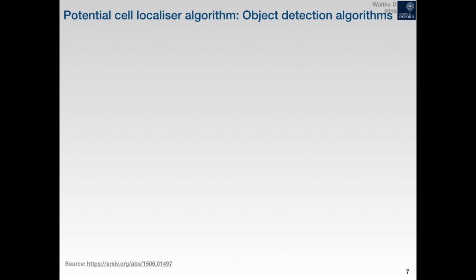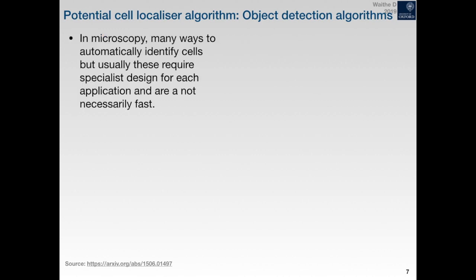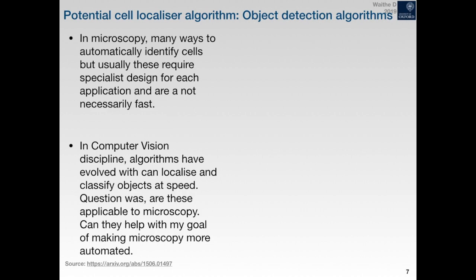And then we wanted a way of localizing the cells which was very fast and also very accurate. And we wanted it to be generic, so that one week we can run one assay, another week we can run another assay. Although in microscopy we've got very good signal processing algorithms, they are what we would define as being somewhat fragile, as in you need a skilled image analyst to tune it for a particular situation, and then that algorithm may work very well, but then you basically have to start from scratch if the visual phenotype of your next assay is different.